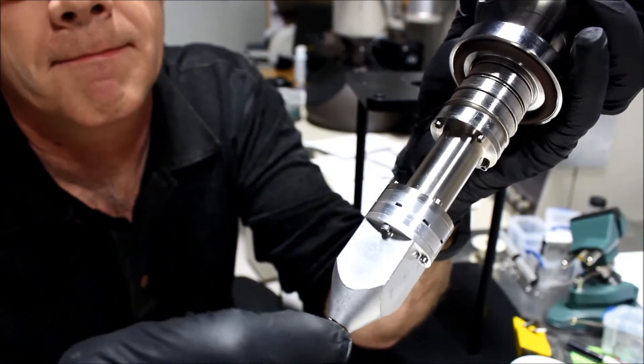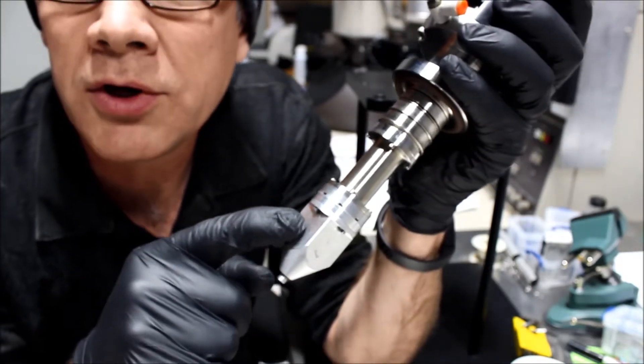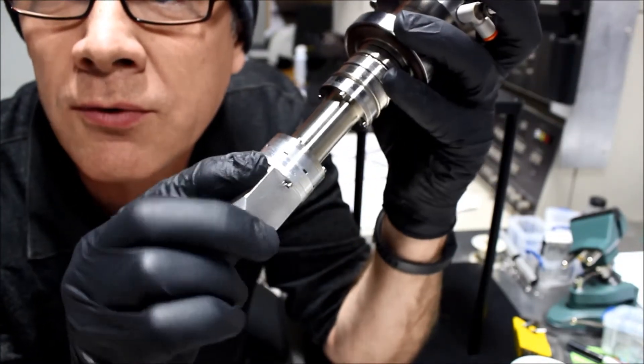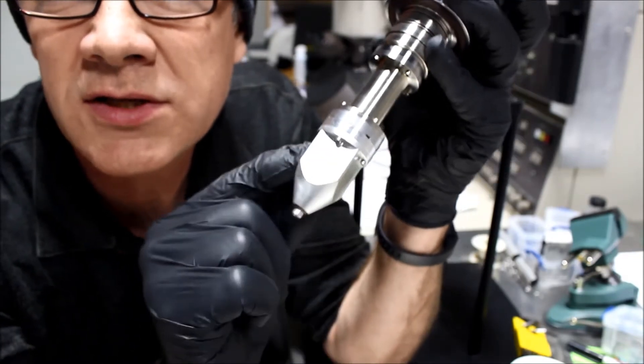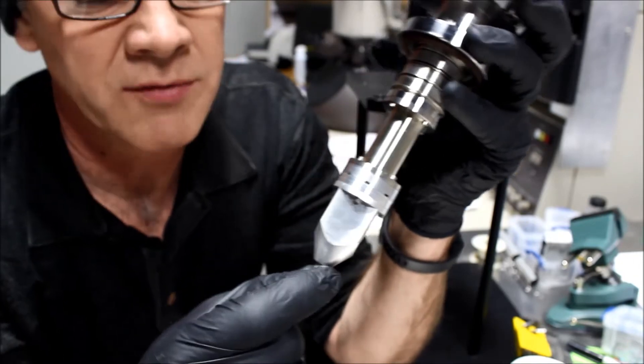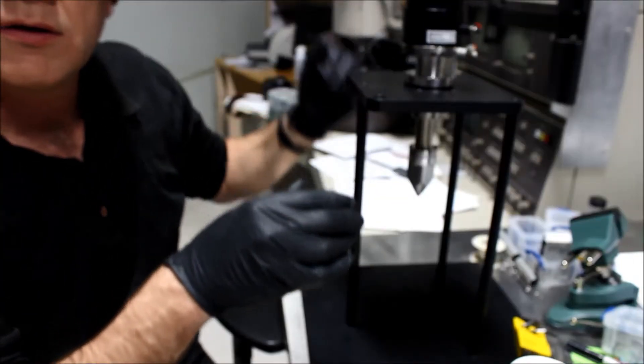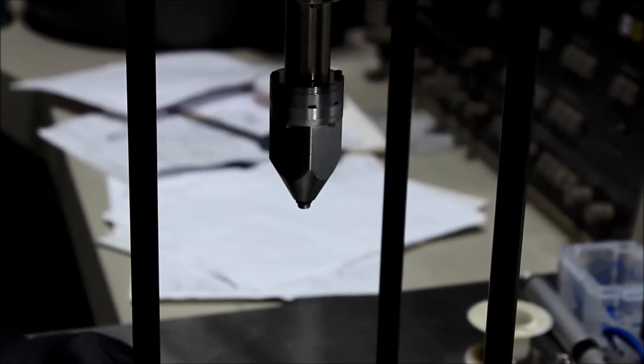Now all we need to do is remove these four little 2-56 socket head cap screws. The easiest way to do this is to place the GIS in a stand so you can have your hands free. It holds it vertically. Let's zoom in on that so you can get a little more view of it. There we go.